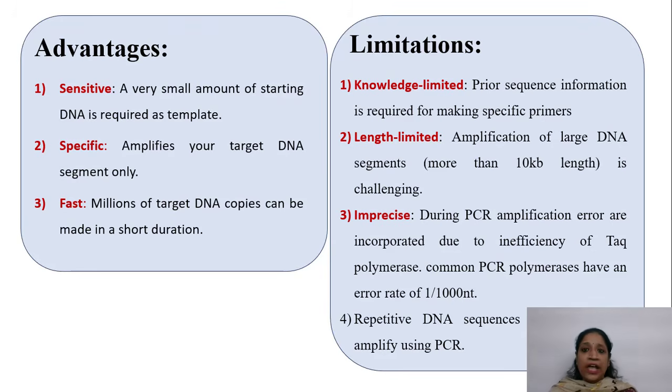This ensures accurate results. Speed. PCR is a fast technique. You can amplify DNA in just a few hours, making it an efficient tool for diagnostics and research. However, like any technique, PCR has its limitations.